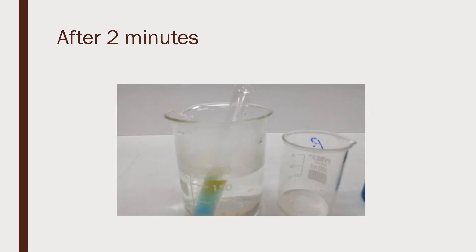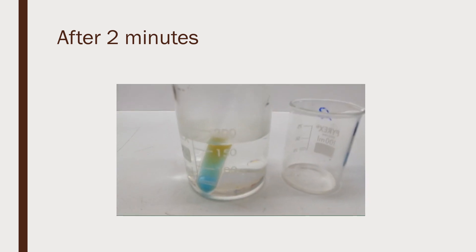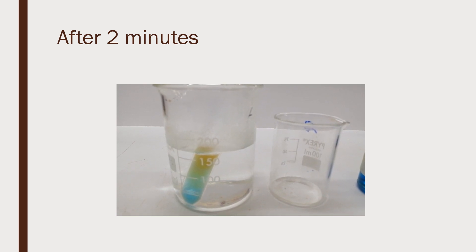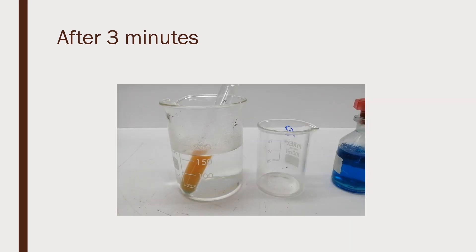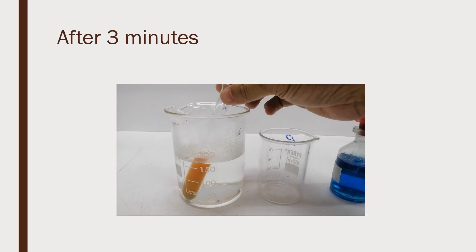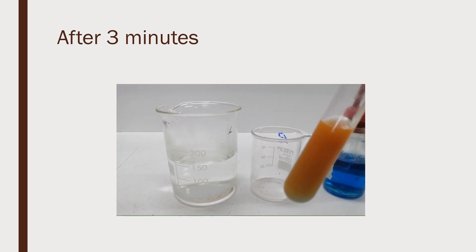After 2 minutes, our test sample turns from blue to green, then yellow. After 3 minutes, our test sample turns from yellow to orange. This indicates that glucose is present.